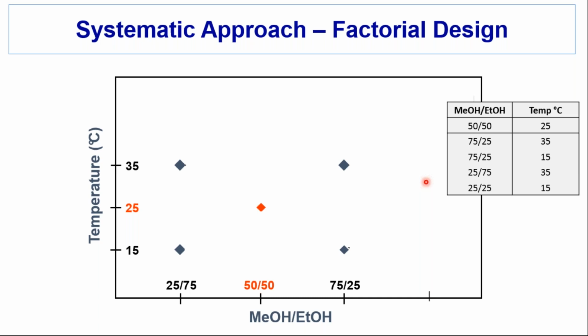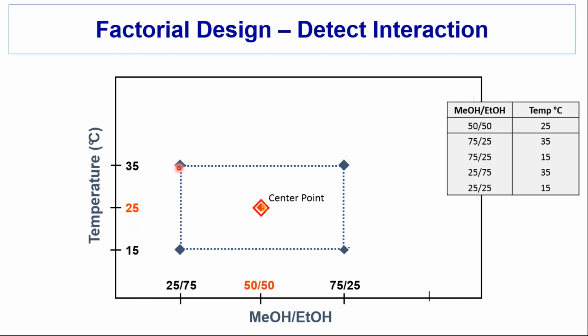But this is a factorial design, and sometimes I just draw this little box with the different parameter levels, and we have a center point. I like to do that just because this is often the starting point, and we make the box around that. This is 5 experiments for 2 levels. That's not too bad. And notice the parameters are easily changed, so we can do that in an overnight experiment or just set it up in the day and come back in a little bit and get your results. It doesn't require that you know what the results are before you do the next experiment. You just have the experiments already run. In fact, this is how you'd fill in a table.